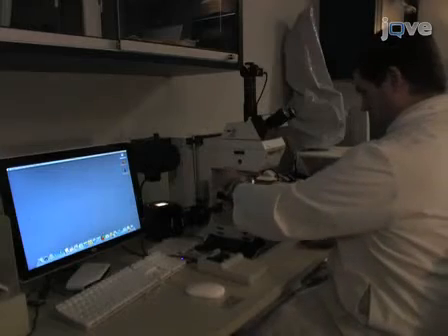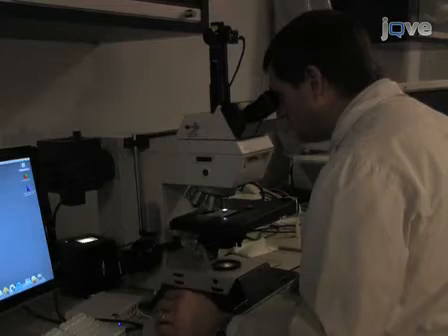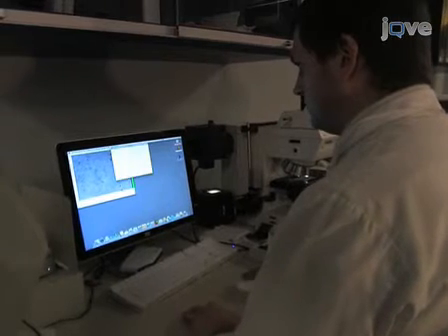We randomly start with one of the first cresyl violet stained sections and systematically sample the rest of the 1 out of 6 thereafter. A total of 13 sections are sampled for the selected subject.